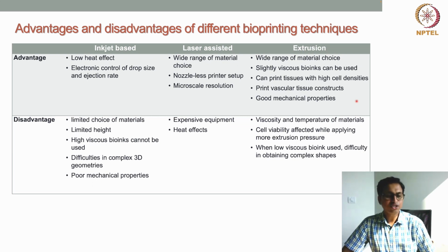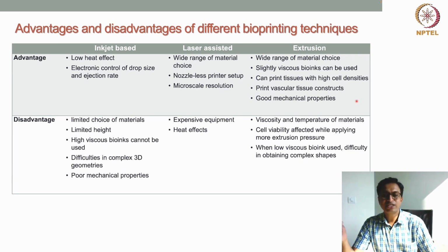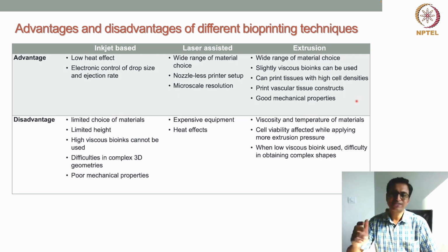Tissue constructs can also be printed, and people have shown the possibility of printing vascular tissue constructs with extrusion. In one lecture, I will discuss how the vascular tissue constructs are printed, targeted with different types of bioprinting technologies. So there we will discuss in great detail.